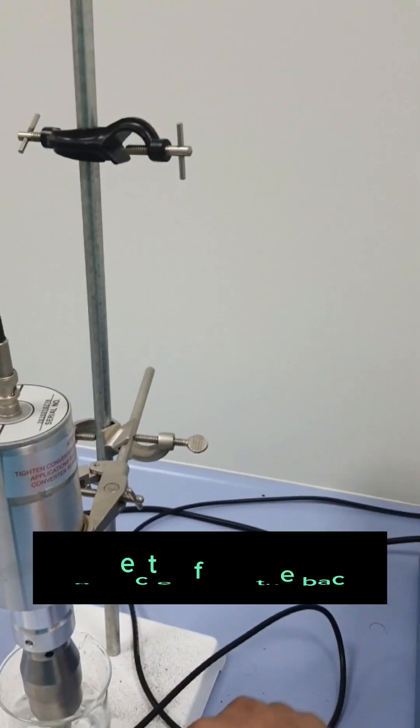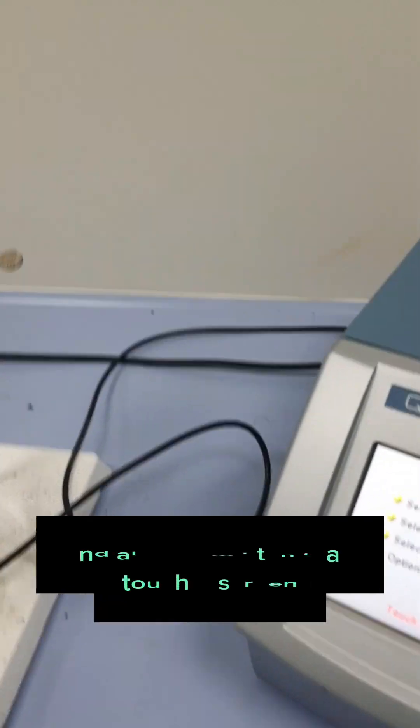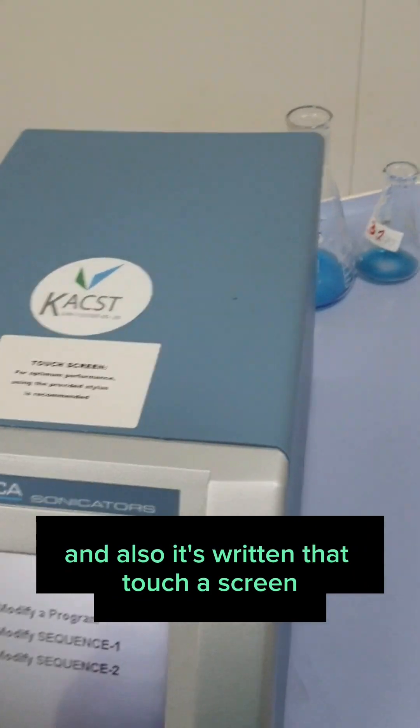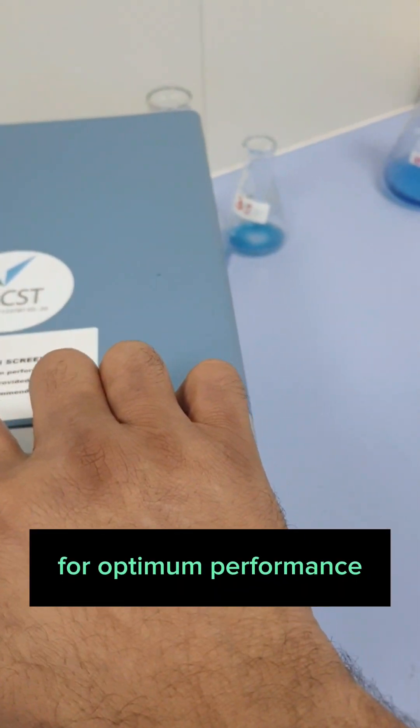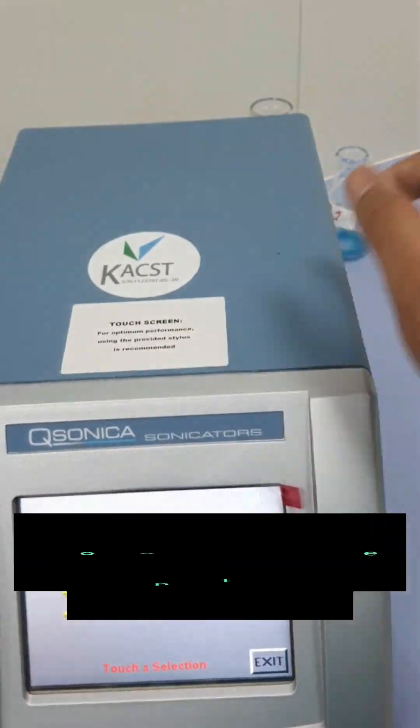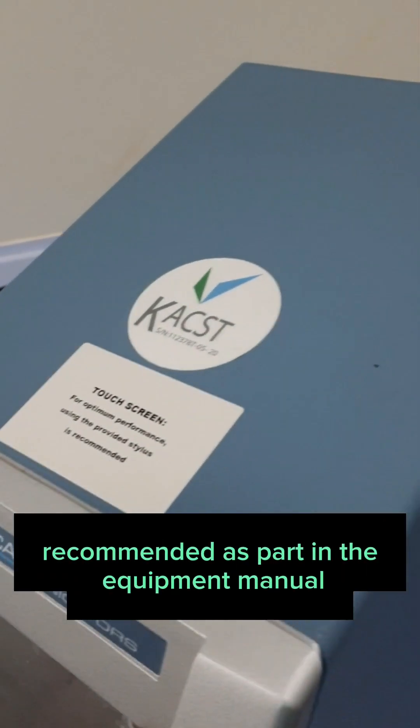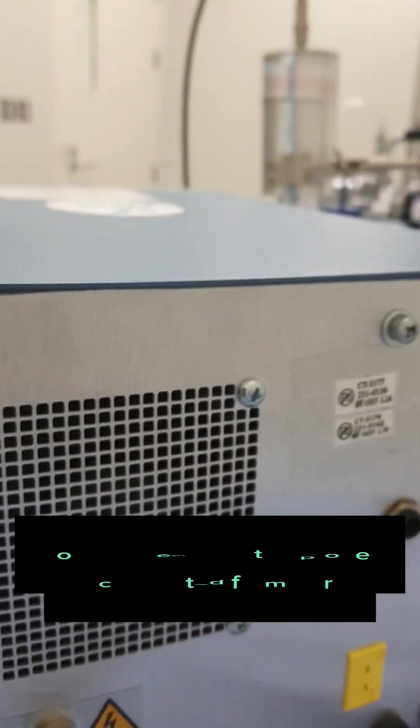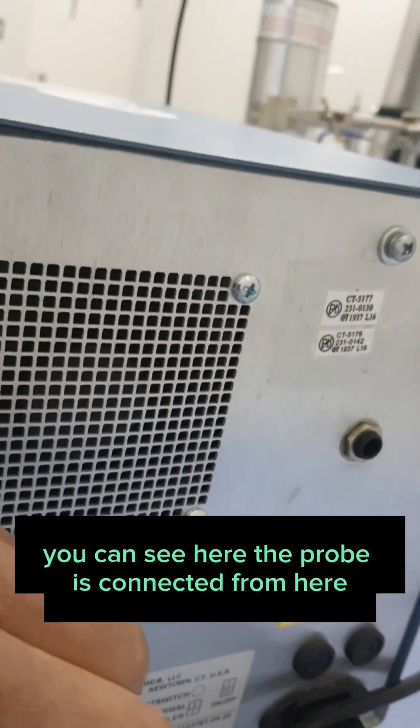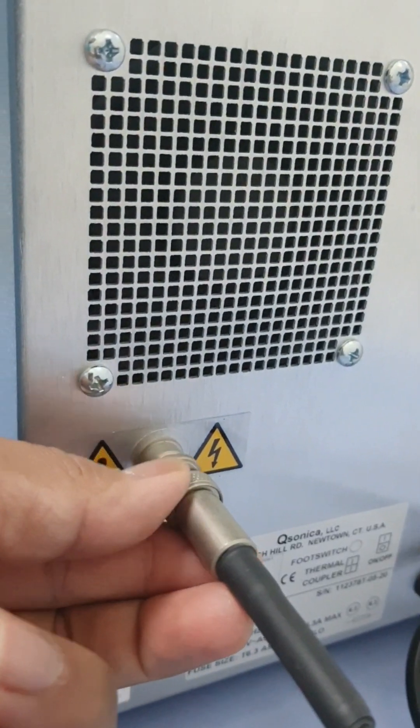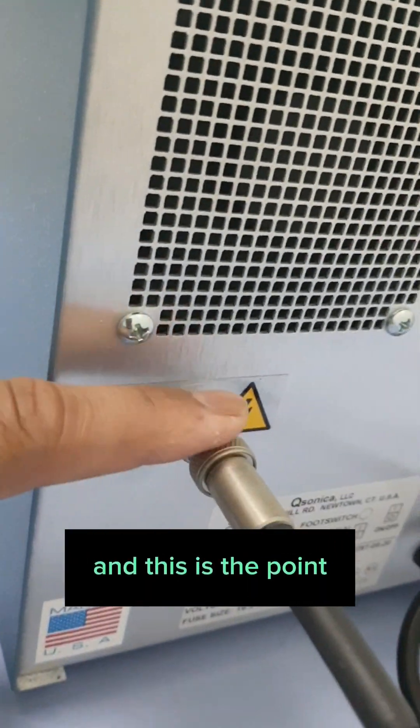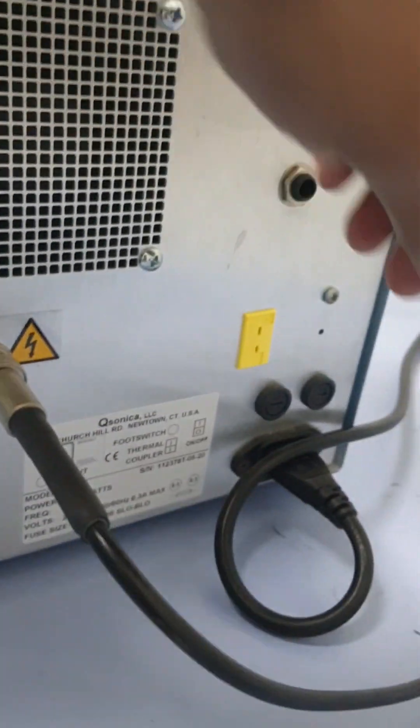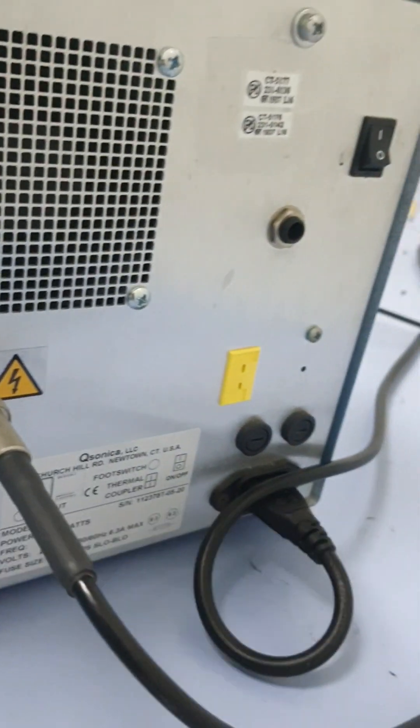Usually the probe is connected from the back. You can see. And it's written that touch screen for optimum performance, use the provided stylus recommended as per in the equipment manual. You can see here, the probe is connected from here. And this is the point. And this one is for the power button.